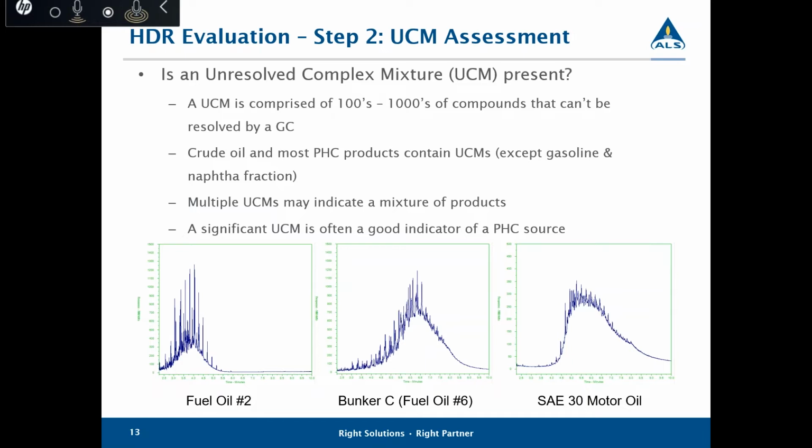It's good to remember that there are a few products, let's say gasoline, that are not going to show the hump, because they contain very light hydrocarbon compounds. Naphtha is the same; they won't show up with the UCM, the unresolved complex mixture.